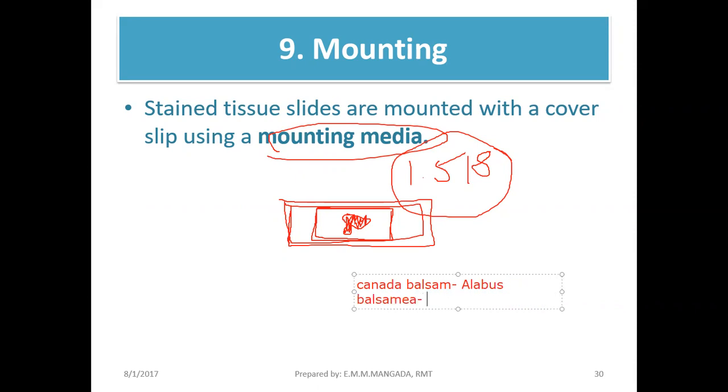Okay? So this is an example of a resinous mounting medium. So mounting media. Okay. So guys, yung Canada balsam natin, it's derived from a tree. So ibig sabihin, it's naturally sourced. So it's an example of a natural mounting medium.